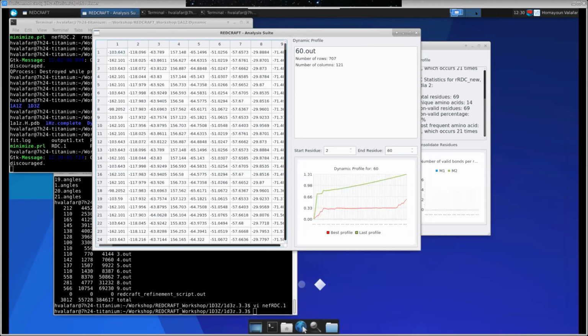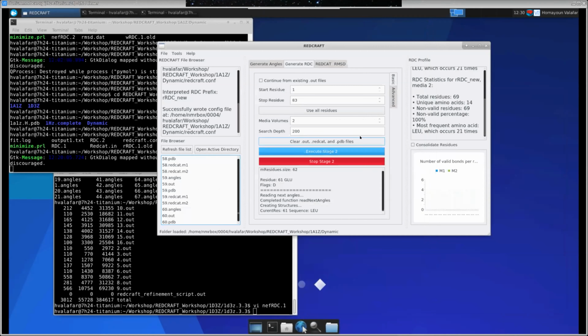So, Homi, while we're waiting, can I ask one more hypothetical question? No problem. So if I had, let us say for a structure, an infrequent exchange problem where I have two peaks, which 100% I don't know, let's say I've assigned pretty much every one of them, there's an extra peak, I'm kind of scratching my head. Will this dynamics-based approach shed some light saying there is some exchange going on at that part?